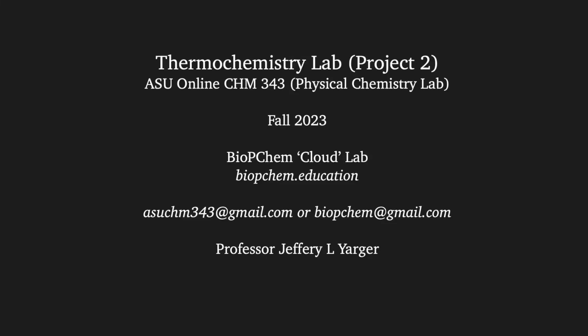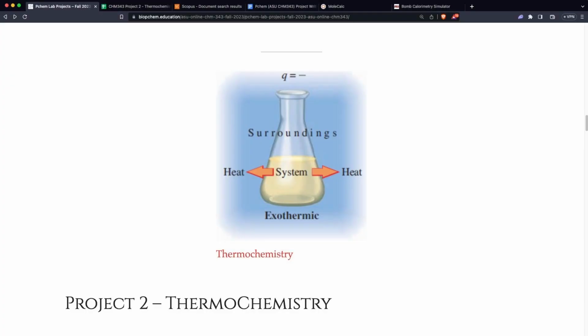Online Physical Chemistry Lab for the fall 2023 has students doing Thermochemistry Laboratory as project number 2. And information about this can be found on a public website at biopchem.education. Let's head over to that website and go to the project information, scroll down to project number 2, and here we provide an outline.